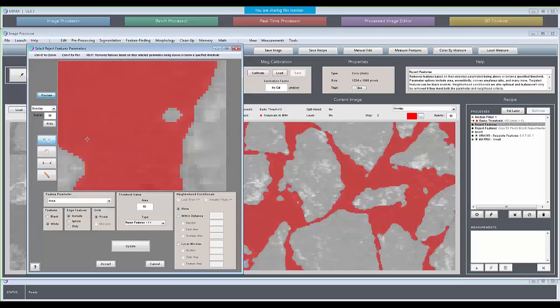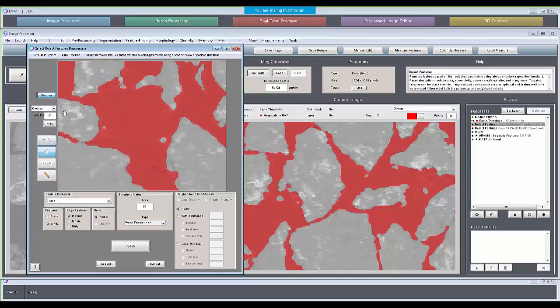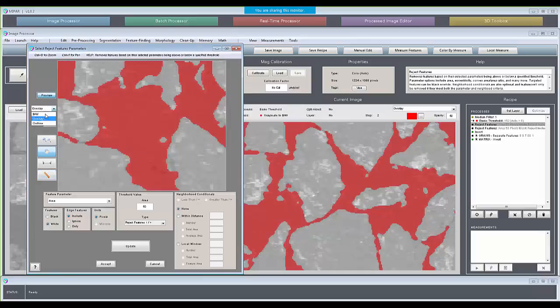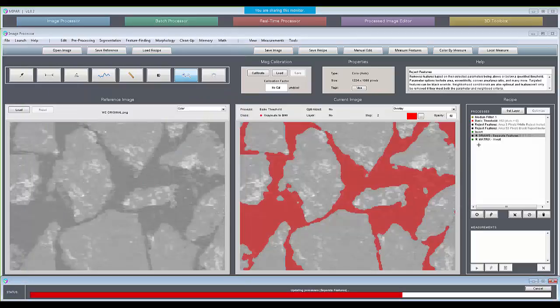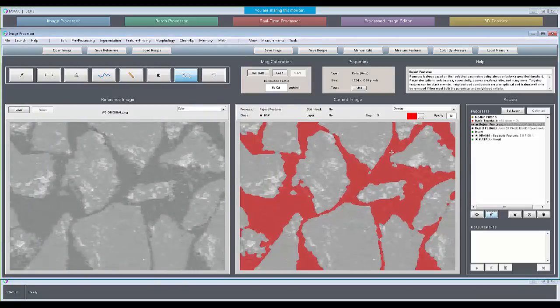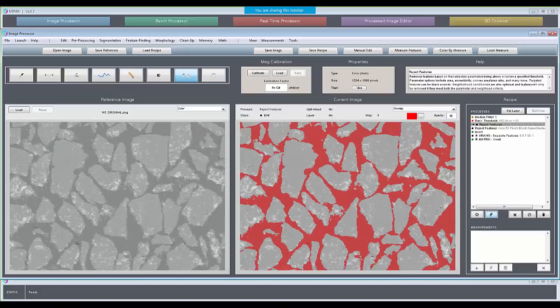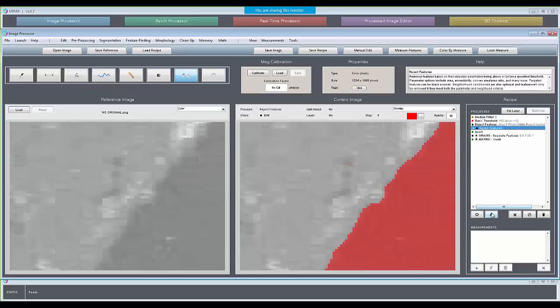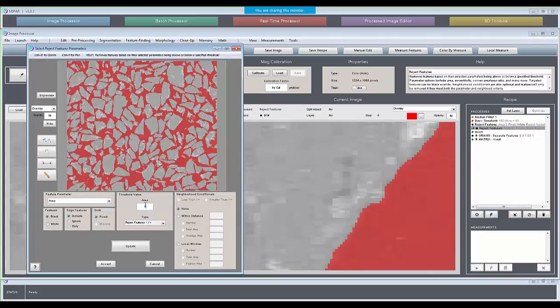Here's a good case. These two here are 5 and 25. I'm not sure if this one is one that we'd want to keep. Perhaps it is, but maybe we could at least say if you're under 3 pixels, we're going to get rid of you. So we reduced that from 50 to 3. The black ones, or the selection noise like this, we probably still want to keep in place, but maybe it too can go down from, say, 50 to 10.